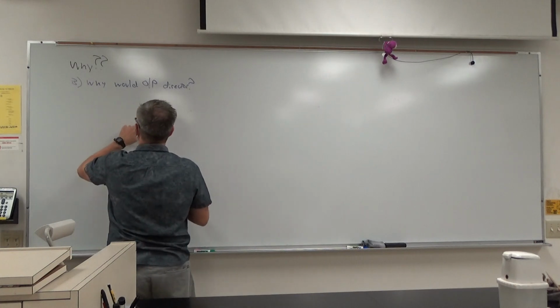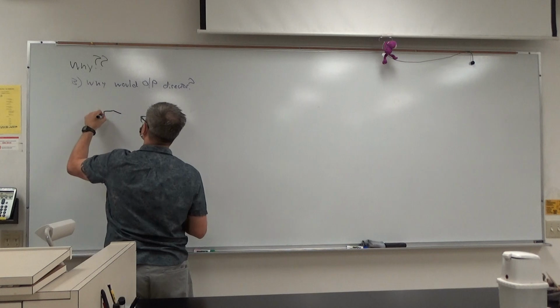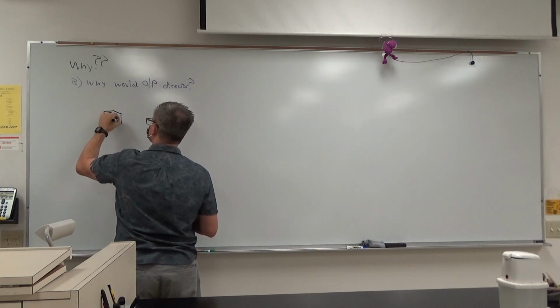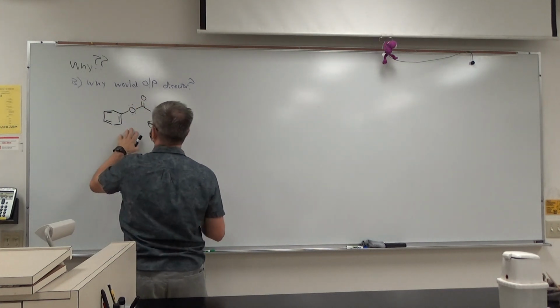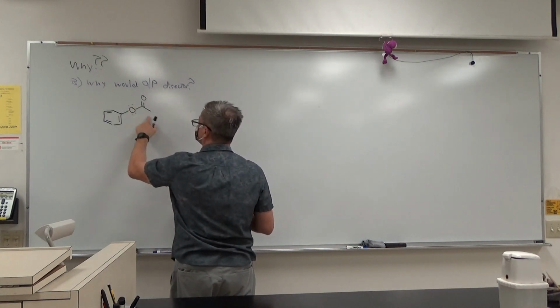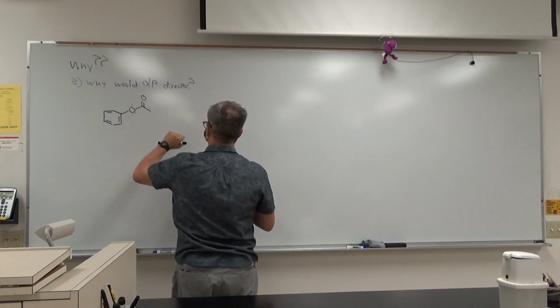And to show it to you, what I'm going to do is I'm going to take methyl benzoate and just change it ever so slightly. I'm going to switch the position of the oxygen, making it an ortho-para director. Okay? The methyl benzoate, it's like flipped.